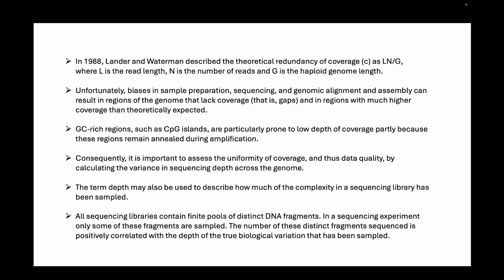So how is PCR done? On a single strand, you give DNA polymerase and it generates another strand. But in this case, the single strand is already a double strand because of the GC rich region. So the amplification process is not done properly. So the number of reads arising from this GC rich region is very low because of your inability to amplify those regions properly.